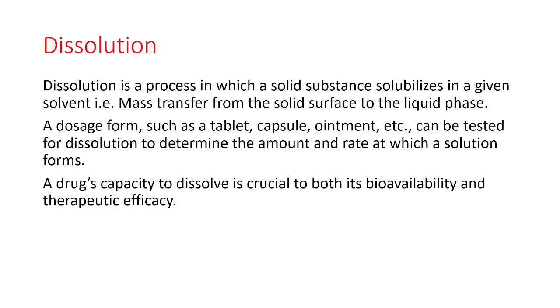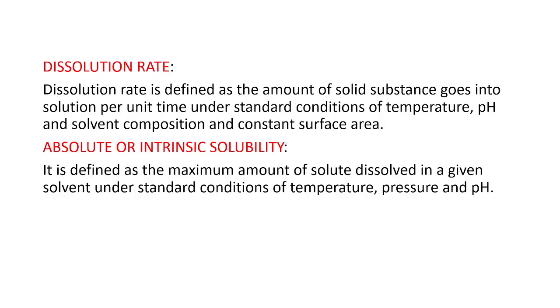What do you mean by dissolution? It's a process in which a solid substance solubilizes in a solvent. It's a mass transfer from the solid surface to the liquid phase. A dosage form such as tablets, capsules, ointments can be tested for dissolution to determine the amount and rate at which a solution forms. A drug's capacity to dissolve is crucial to both its bioavailability and therapeutic efficacy.